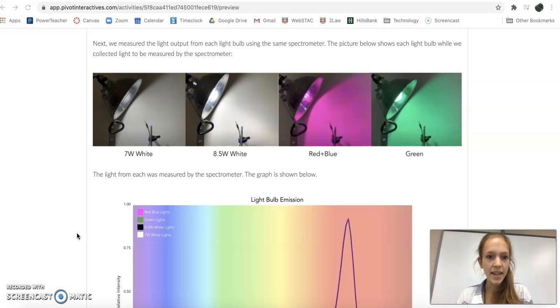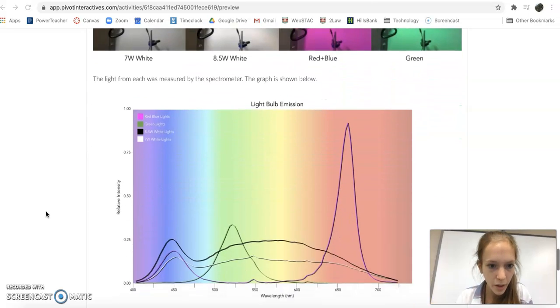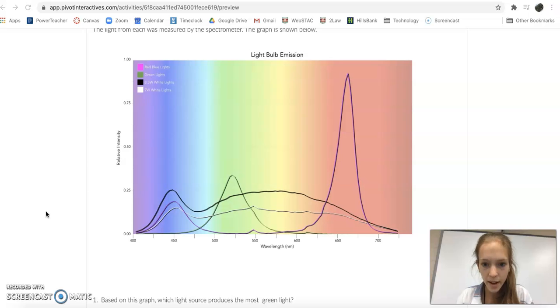So part 3, guys, it's got some really great information, but I'm just going to tell you right now, the graph is a little bit hard to read. So if you have trouble reading the graph, just listen to what I'm sort of helping you read, and hopefully that will be enough information and you can kind of see what I'm seeing. So our graph is plotting 4 different curves here. And what they've tried to do is kind of trace over each curve with a different color to indicate which light source we're talking about.